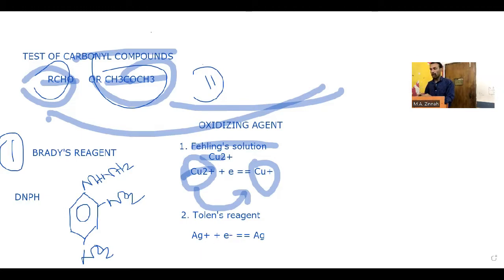I want to show you a video. Testing aldehyde, distinguishing basis.